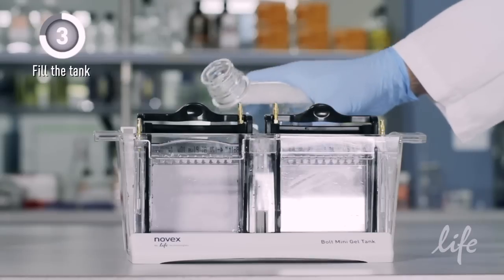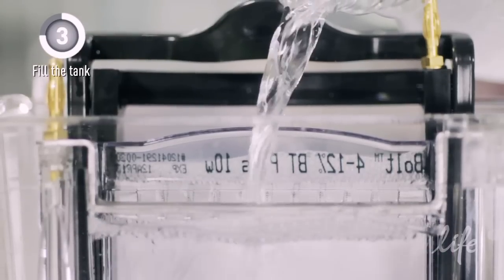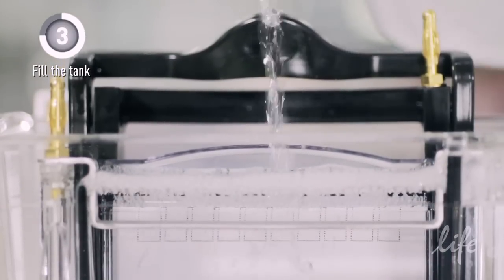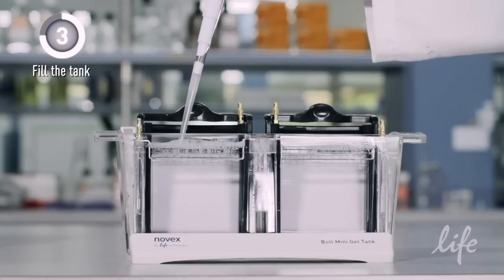Next, fill the electrophoresis tank with 1x Bolt SDS running buffer so that the level is above the electrode but not over the top of the cassette. Rinse the cassette wells with the running buffer.